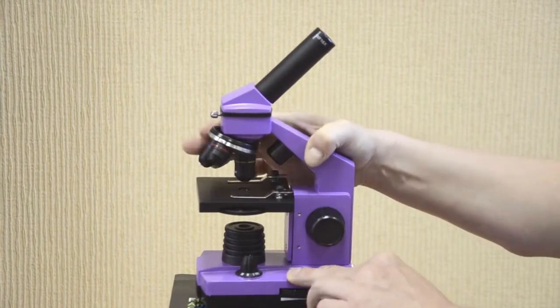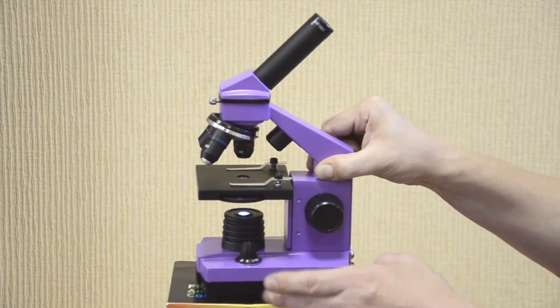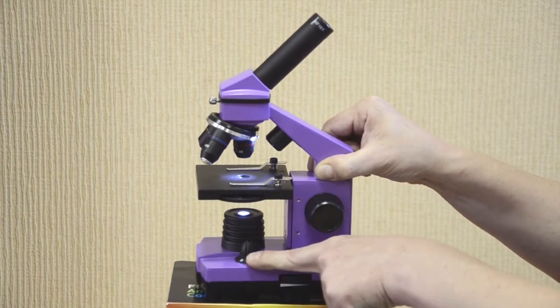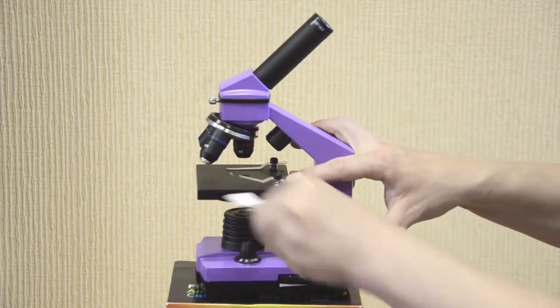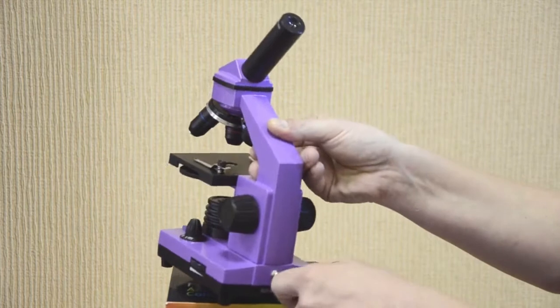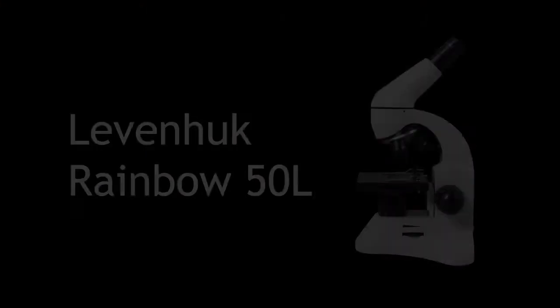The revolving nose piece holds three objectives. Focus adjustment is smooth. The lower illumination and upper illumination both have adjustable brightness, and combined illumination with both upper and lower lights can be used. Here's the diaphragm disc and slide holders. You can plug the device into an outlet using a 110V or 220V adapter included in the kit, or insert three batteries. The eyepiece is removable with 16X magnification power.